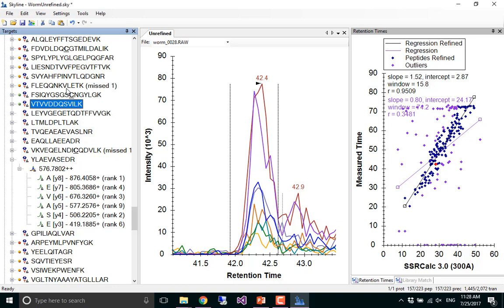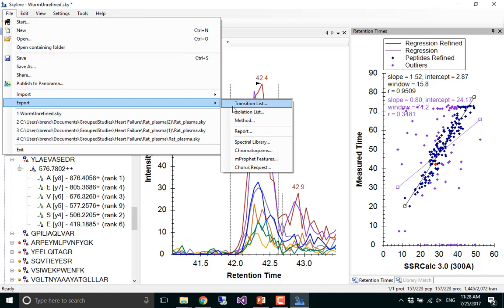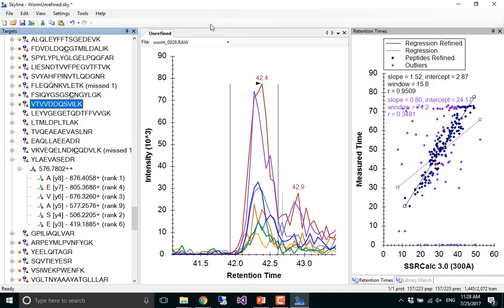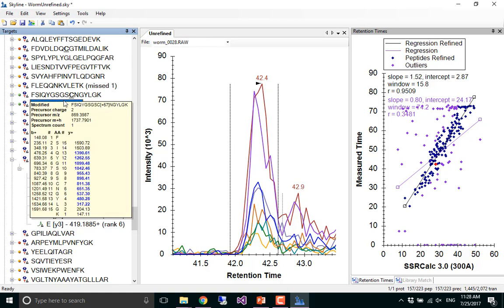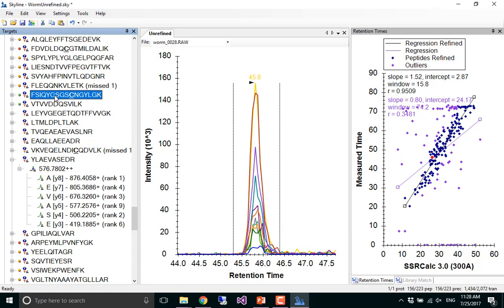This is the reason we have file export method now. She did file export transition list before export method existed, and then she sat down with a method template, generated all the method files, and put them all into a sample list. My interpretation is that when she was pairing methods with transition lists, she ended up naming the same transition list put into two methods.